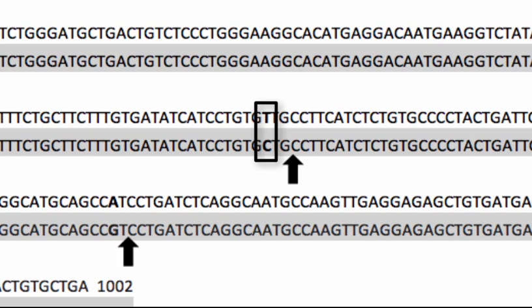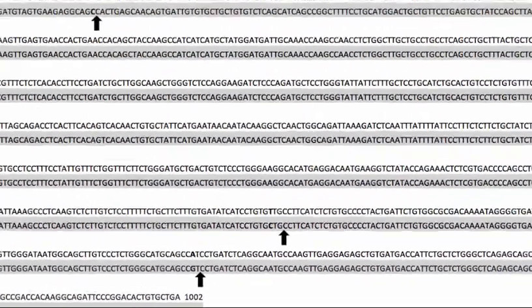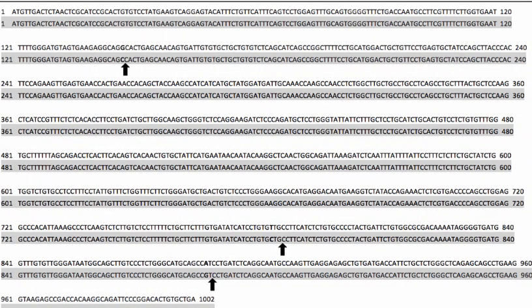There are 6.5 billion base pairs in our diploid genomes, and we're going to zoom in on a single base pair in this analysis. Obviously, we're going to need some pretty sophisticated methods and equipment, and the procedure you follow in order to complete this successfully is multi-step. Now you must pay close attention to the written instructions and follow them to the letter. As in almost any multi-step procedure, if you mess up anywhere in the sequence, you won't have any results to look at later.